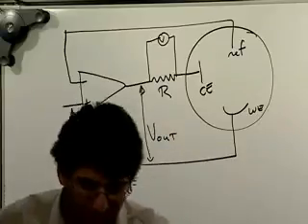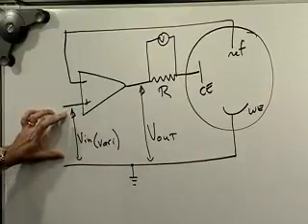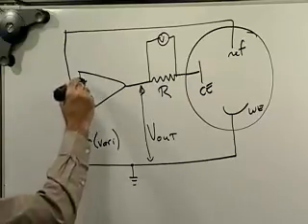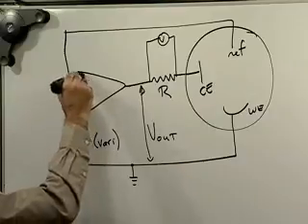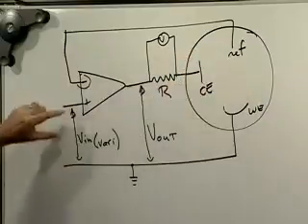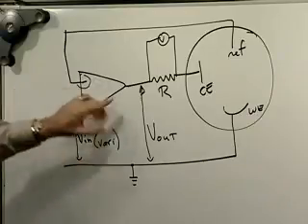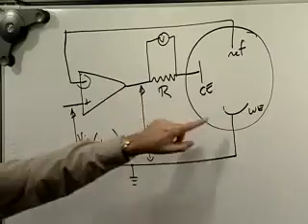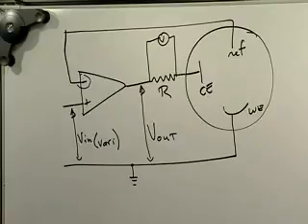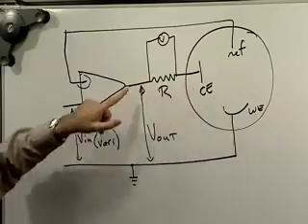And we see from this analysis that we can't change one without changing the other. So V in, remember, whatever we put over here, that voltage has to show up over here. So if we get a difference in voltage between our working and reference electrode, it has to be adjusted back here, so that's why it's variable. And that will lead to a different voltage between our working and our counter electrode. So this is set up with negative feedback. That is, if one gets bigger, the other one's going to get bigger until it zeroes out again. And we can measure the current flow associated with this.